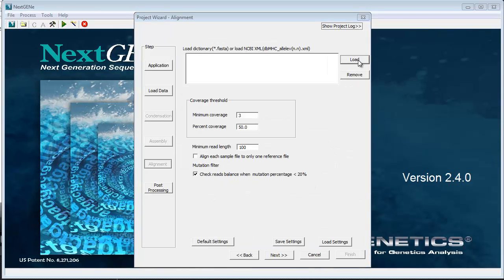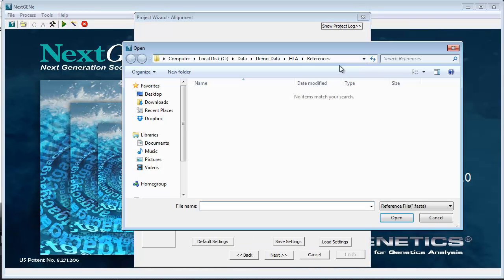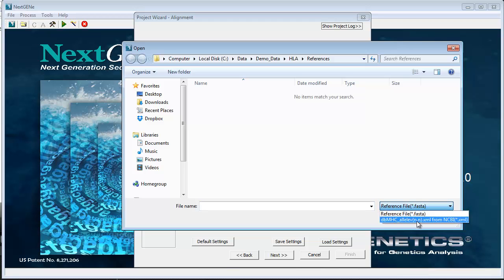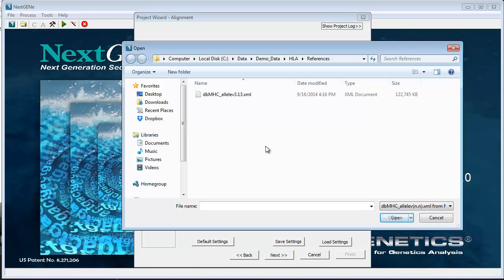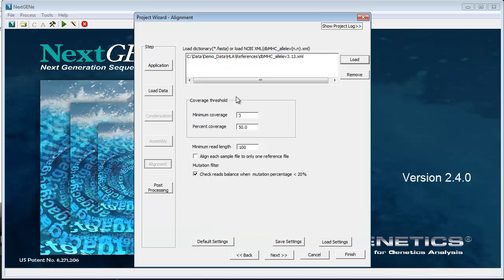Click Load to load the dictionary file downloaded from NCBI in XML format. The following settings can be modified as needed.